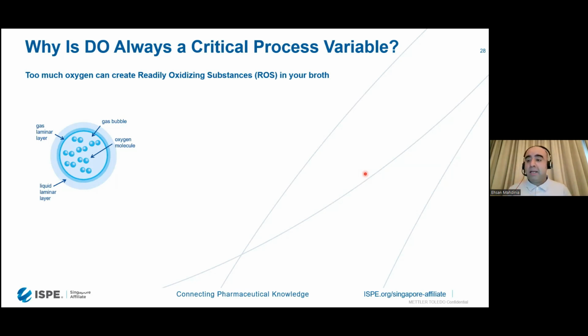So in high cell CHO, for instance, for monoclonal antibody or other protein production, we often choose to go up on concentration of oxygen instead of going up on aeration rates, or agitation for that matter. And in fermentation, of course, in high cell E. coli or yeast, the consumption is so much that air is not enough to provide the oxygen.